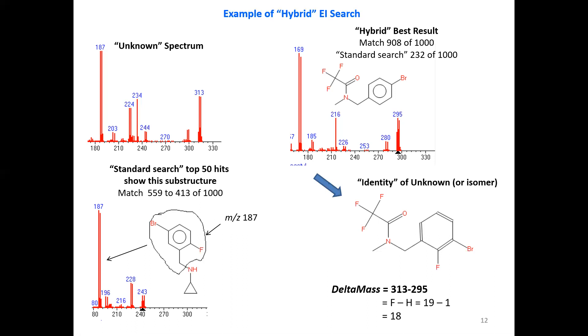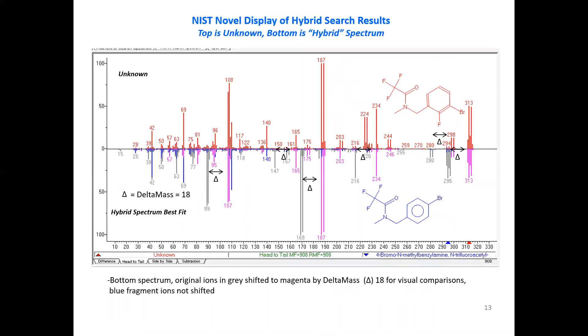They do have a very novel display of the hybrid search results, which I think is very effective and very efficient at looking at the hits in the list. They show here is the hybrid spectrum best fit on the bottom. We have our unknown on the top. Anything that's shifted by the delta mass goes from gray to magenta. And anything fragment ion that was not shifted stays blue. So when you look at these after a while, you get used to ignoring the gray and just looking at the blue and the magenta. And you can see why the hit is so high that approaches just a little over 900 because it actually is a good fit if you look at it in this regard.